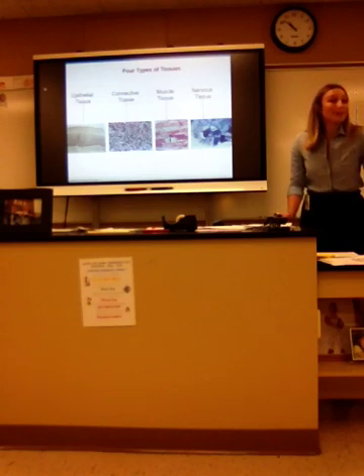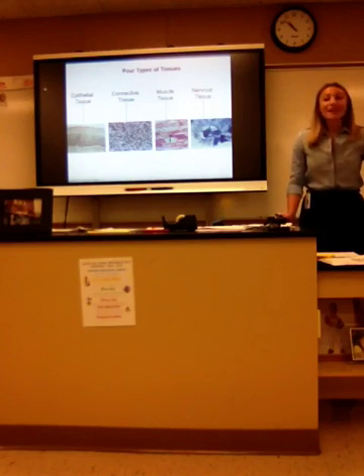It's squamous, but is it simple? Stratified. Why is it stratified? Because there's layers. Yes. Great.